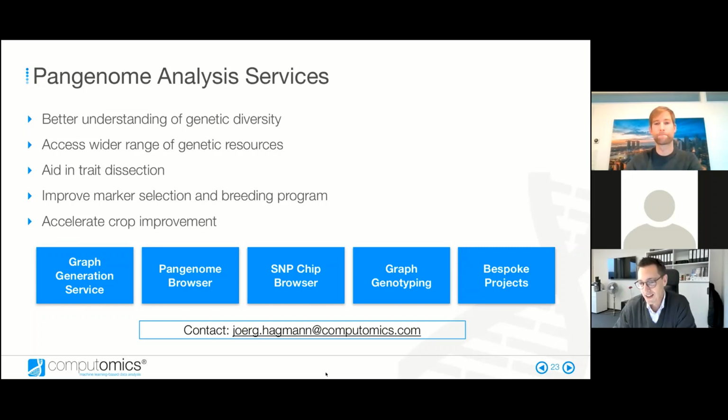First one would be, thanks for the presentation. Also from one of the participants, he does have multiple questions. The first one would be, is there any demo available somewhere? The only one I found was the genome graph version for COVID data, which is a bit old compared to the one you demoed today.